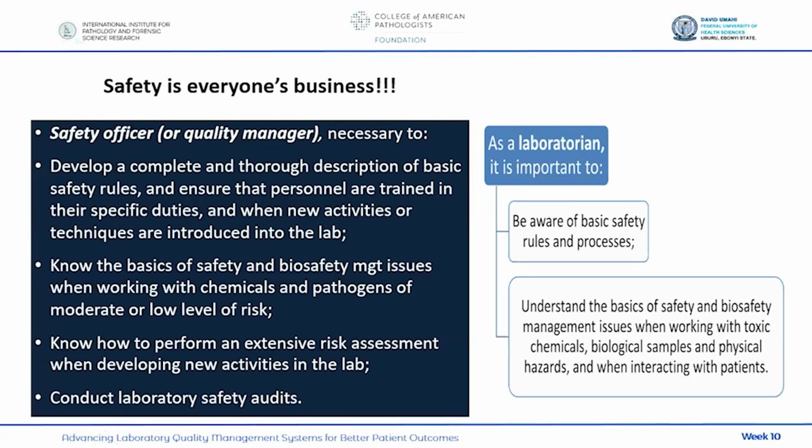Okay, so that is safety. Those are the hazards. And when we come to safety, nobody takes a back seat. Safety is everyone's business. Nobody takes a back seat. Because somebody will say, okay, we have a safety officer. Safety officer, it's your work. It's your responsibility. Okay, no. But safety is for everybody. Everybody is called to take action.